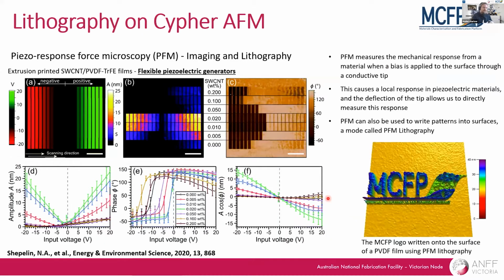And then pushing this further into the fabrication space, we can actually do lithography on our AFM as well and do other things that involve making mechanical changes within the surface using that tip. So here we're talking about something called piezo response force microscopy, or PFM, and imaging and lithography using that capability.